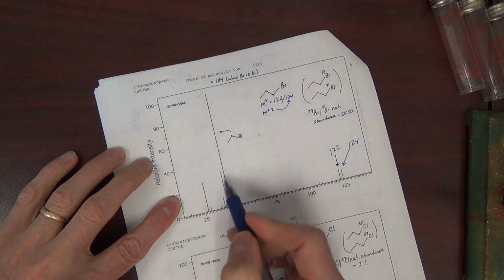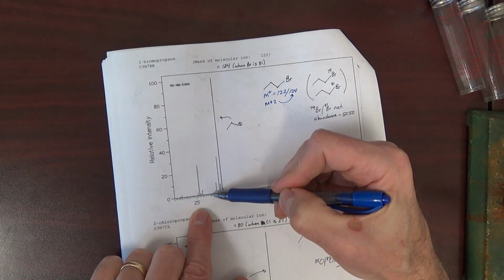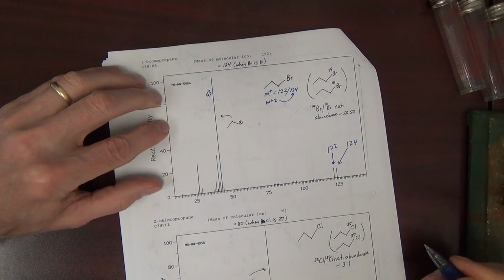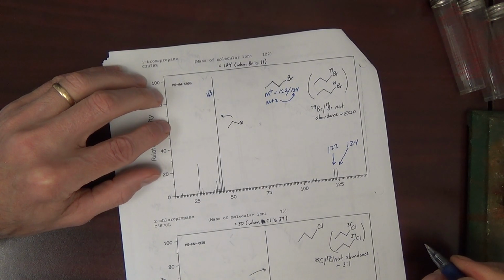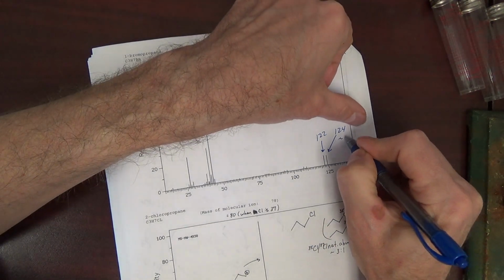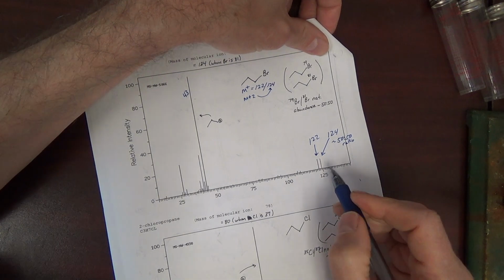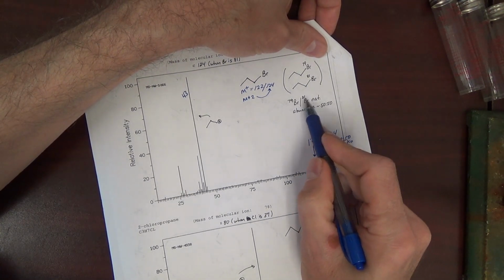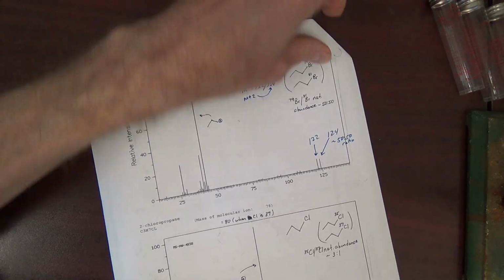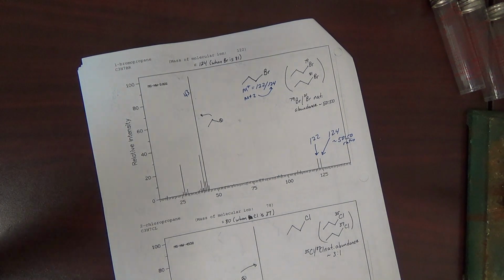Cleavage, pretty clean through here. The base peak is at, what's the base peak? 20, 30, 35, 40, 43. Base peak is at 43. By the way, before we move on, note that these two are in about, very roughly, about a 50-50 ratio. That's what we would expect, because naturally these two isotopes are in about a 50-50 ratio. Now you might have some slight variation due to basically the fine-tuning of the instrument.